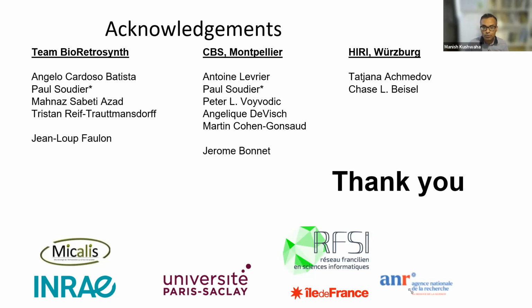We used sigma 70 promoters, and historically in our lab, we have done this because we arrived at cell-free more as a biosensing mechanism. If we want to sense specific metabolites using transcription factors, then these transcription factors will have to use the native promoters, which often will go through the E. coli native RNA polymerase. So if you want to have a T7 promoter activated by a small molecule, then there is a whole lot more engineering involved there. So that's why we always use native E. coli promoters.